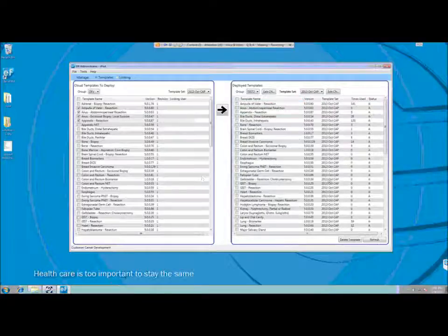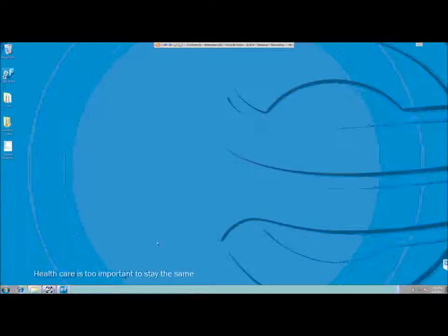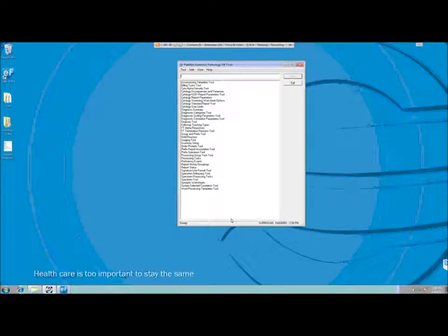Okay, so once you pull in the worksheets that you want to use on the mTuitive side, I'm going to take you back to the Millennium side and show you how you can import those worksheets and then associate them with the specimen and report section. So in order to do that, we have enhanced the Synoptic Worksheet tool. So this is the tool that we currently use to associate PowerNote worksheets with specimens and reports.